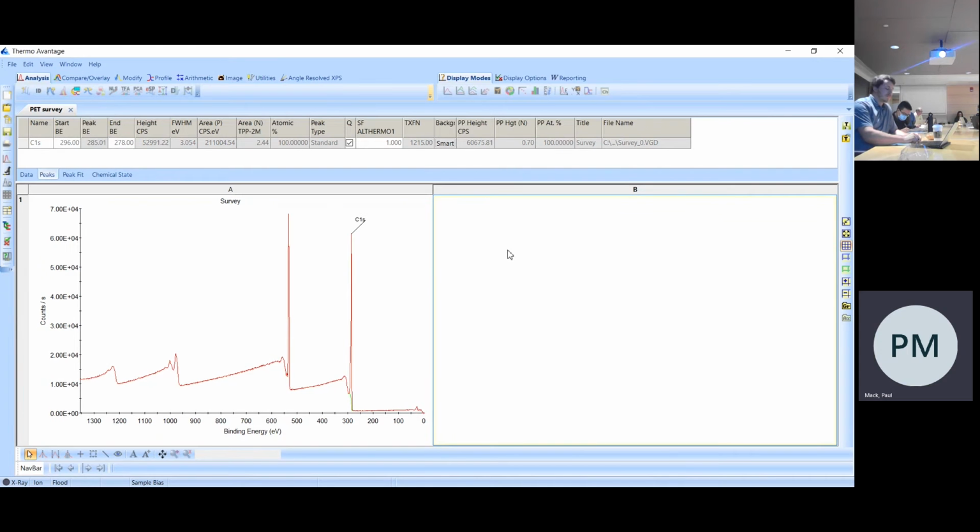Talking about the detection limit, what is the quantification limit? So the detection limit is around 0.2%. Could you hear that? Sorry, James, I couldn't quite hear that. Is there a difference between the detection limit and a quantification limit? Can you be more confident in the detection versus, say, quantification of an element?